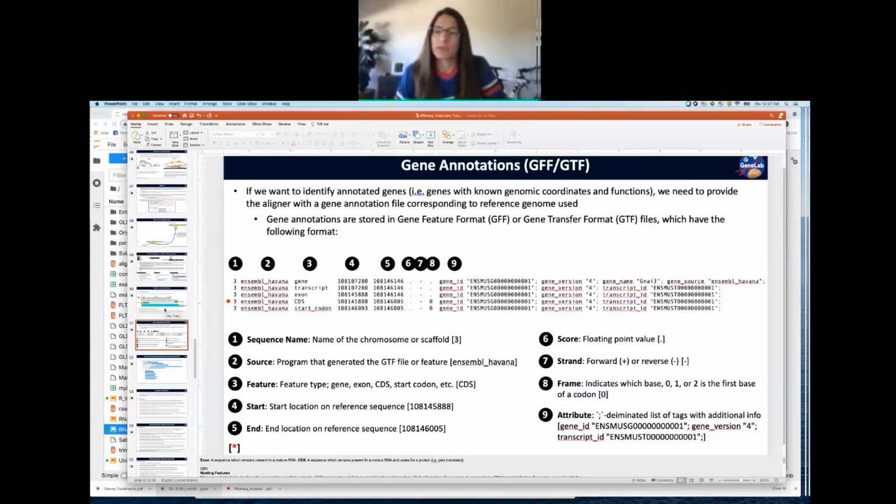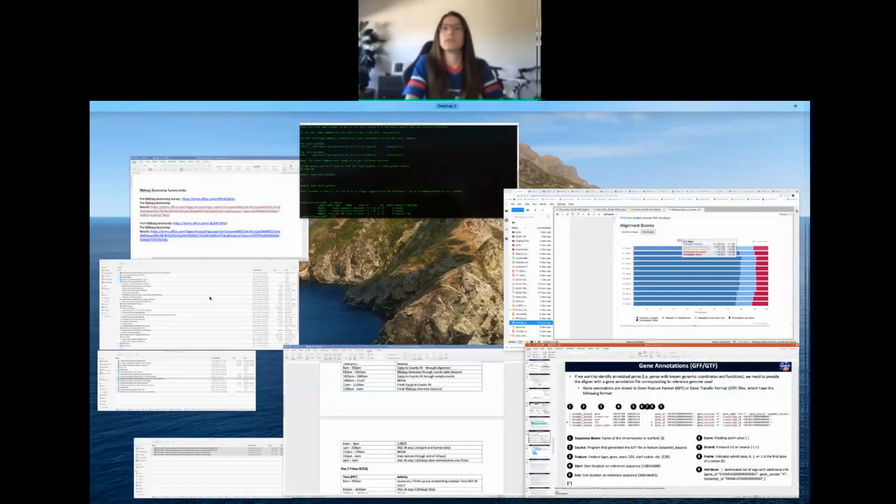Yeah, so there's no really hard and fast rule threshold. So if you ask 10 different bioinformaticists what they would consider as good percent alignment, you'll get 10 different answers. But I think most of them would consider for a well annotated reference that if you have over 70%, that's a good mapping. Good question.